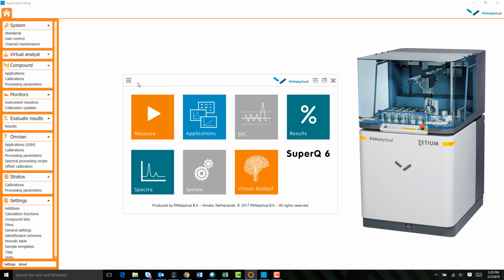In the top left hand side you see 3 dashes. If you click there, we have a database compact. This is useful when you start to generate more data from your measurements. It's useful to compact the user data file. And if you forget to compact here, the software will prompt you to compact. When it does, you should say yes. This will make everything more efficient and tidy things up on the back end for all the files.